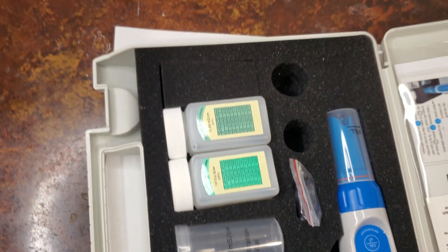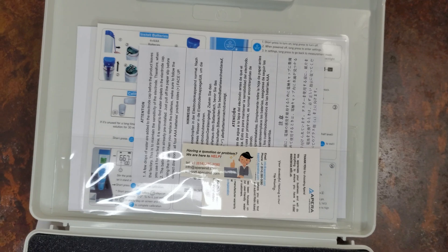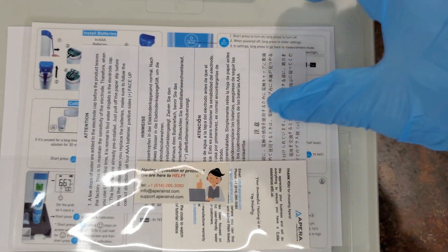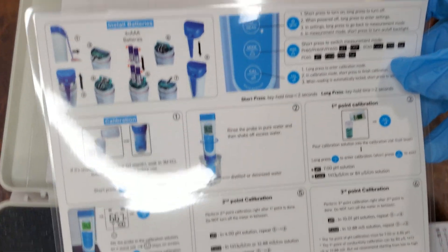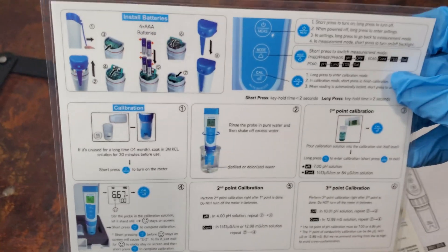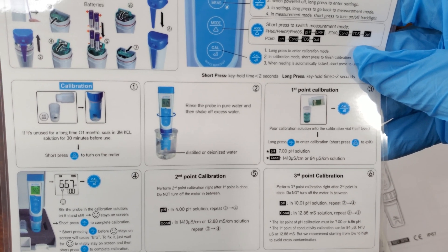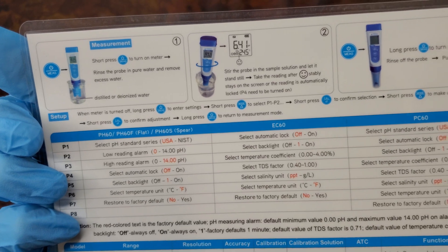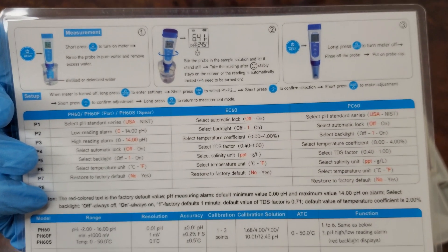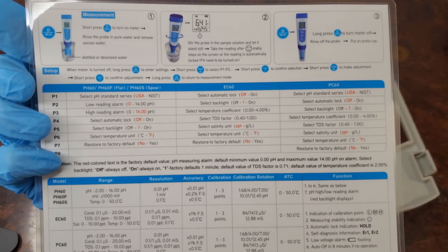This is the device itself. This calibration guide is free for you. A knowledge chart is included with every meter.